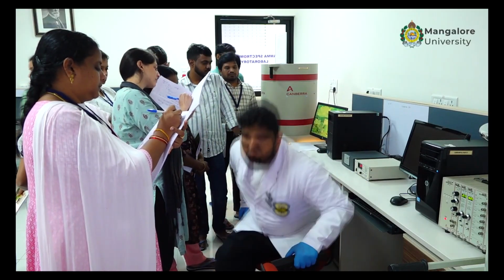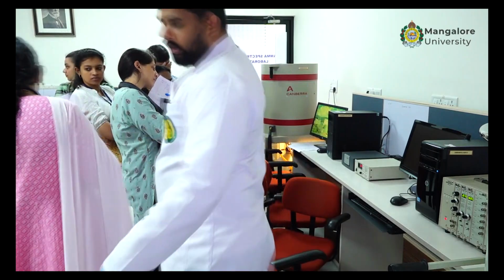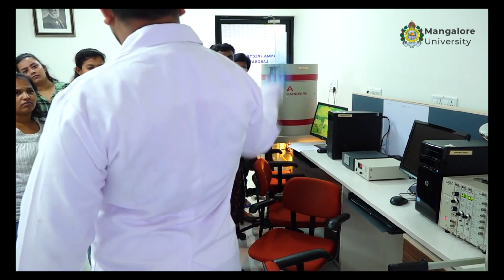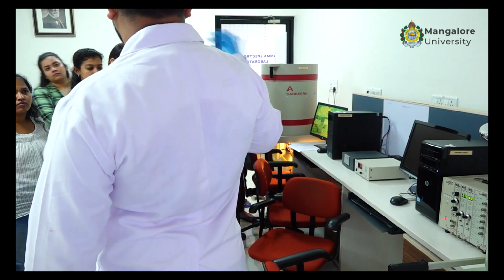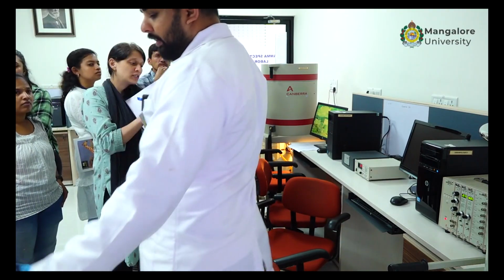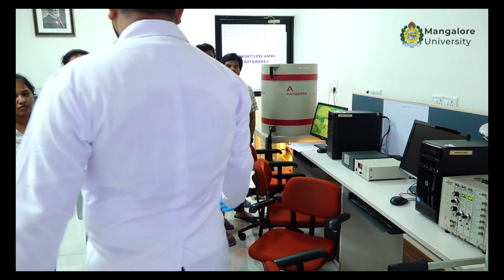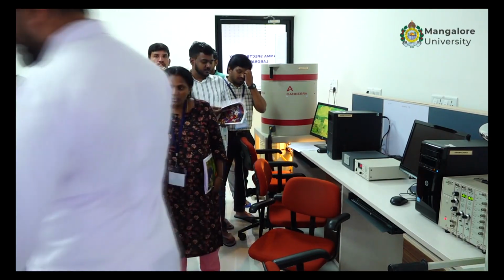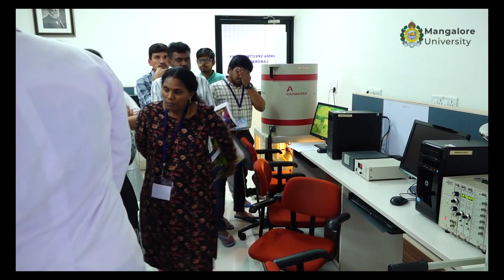So first I will just prepare the sample. How do you want to do it? Do you want to count the sample yourself and take the results tomorrow, or is it okay if I give you the counted spectrum? Because it's again the same thing, it takes a long time, and this doesn't have much activity. So I will show you what exactly these samples are, how we get them.